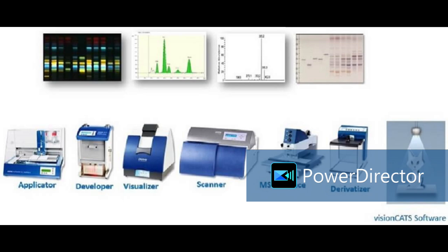And then after imaging, scanning densitometry to scan the plate under different wavelengths from 190 nanometer to 900 nanometer. That is the range of Camag HPTLC scanners, 190 to 900 nanometer. From that region any wavelength we can select for scanning of the plate. And after scanning, if nothing is visible, like sugars are not having any chromophoric group, they are carbohydrates generally, so chromophore is not there.